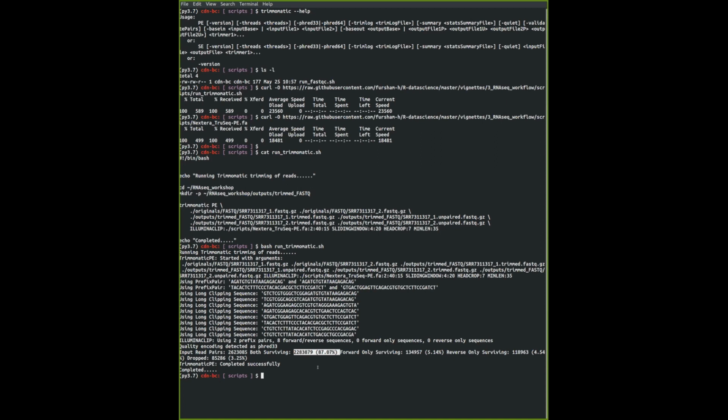This is about still 22 million. So no, it's 2 million. Yeah, 2 million sequences, which is more than enough. Okay.